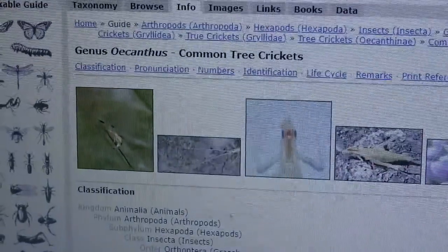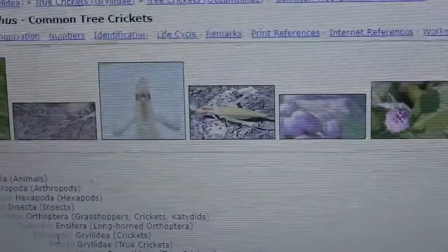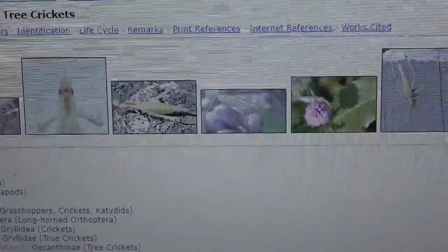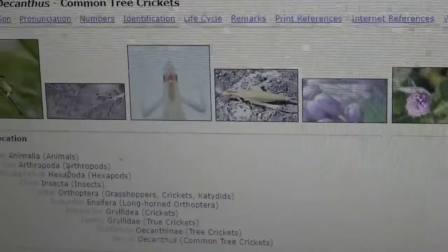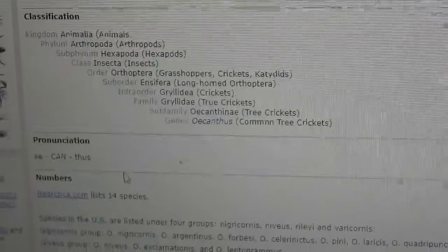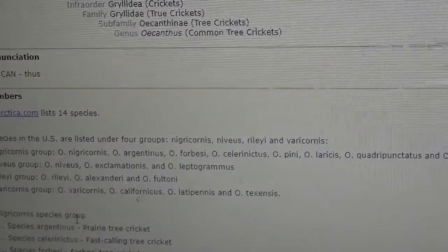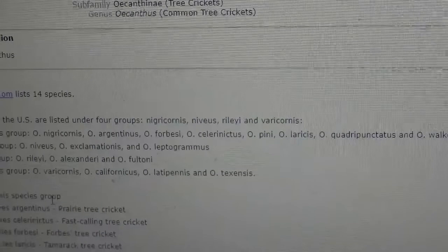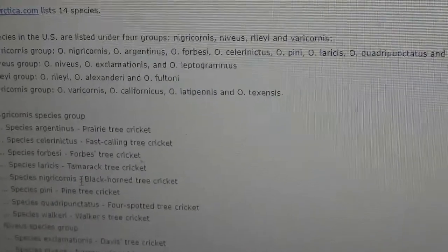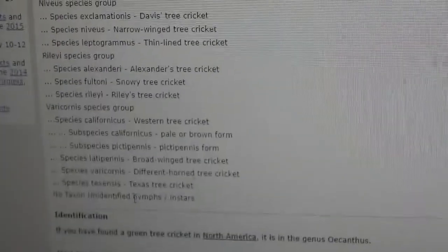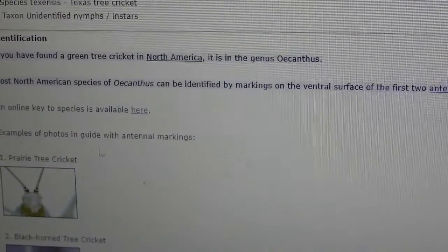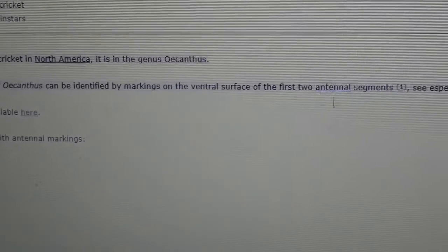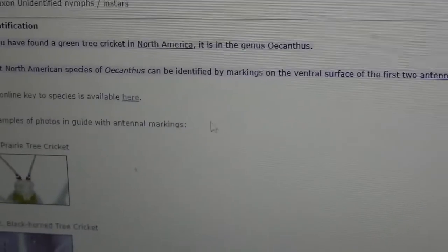So, Oecanthus — Oecanthus tree crickets. You've likely heard them whether you've actually seen them or not. This is their BugGuide page for the genus. There are about 14 species in North America. The key feature is markings on the ventral surface of the first two antennal segments, and that's what we're going to look at under the microscope.